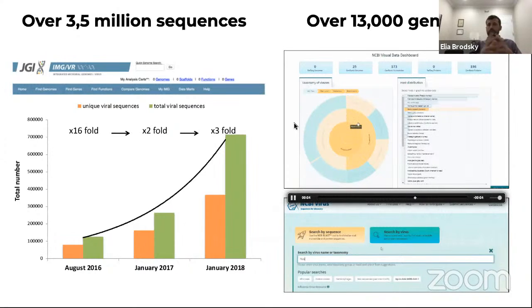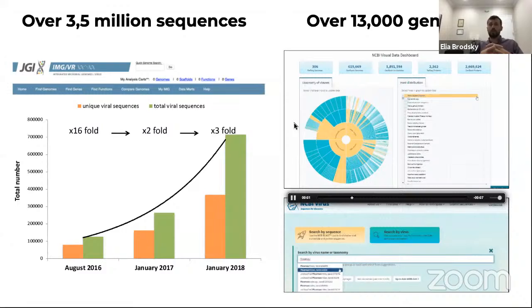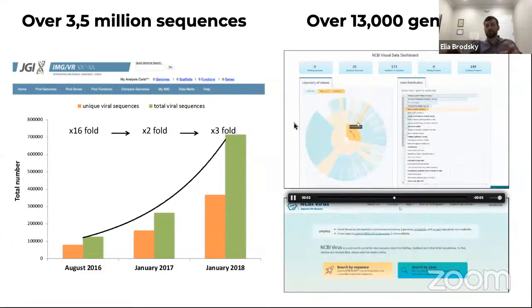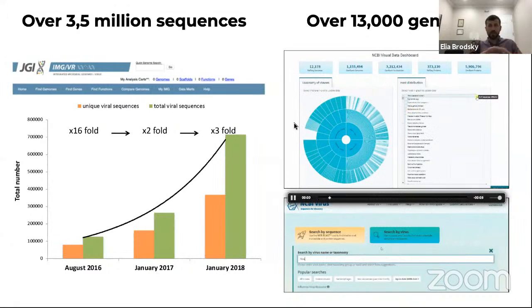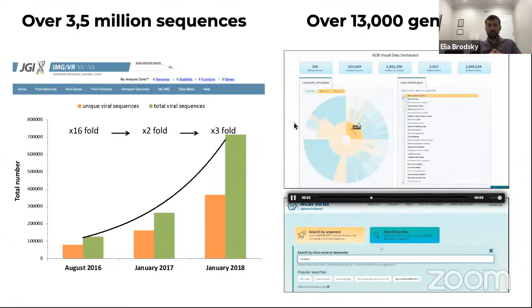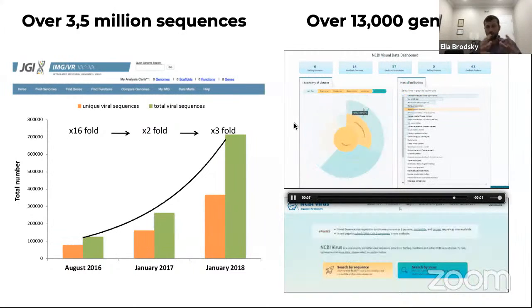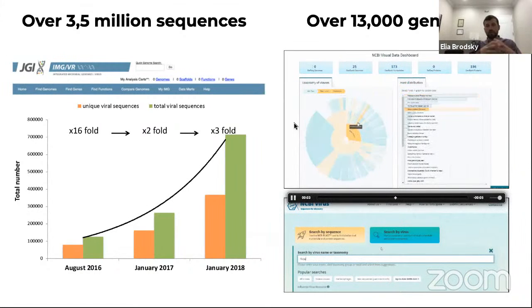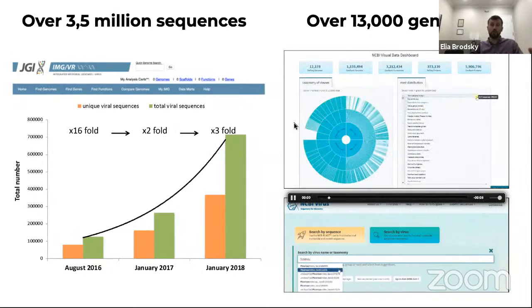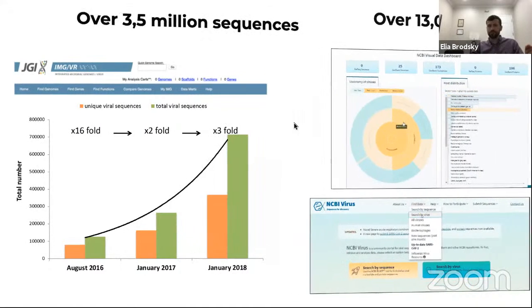And the important part of this is that this kind of sequencing data is available in both raw and processed formats. So when we talk about sequencing, we'll talk about how sequencing is done, different formats of sequencing data, and remember, all of this data is accessible. All of these repositories are available for anybody to have access to. And in the context of the program, we'll have sessions where we actually access this data and we start asking questions of this data using some of the analytical tools that we will discuss here in a second.